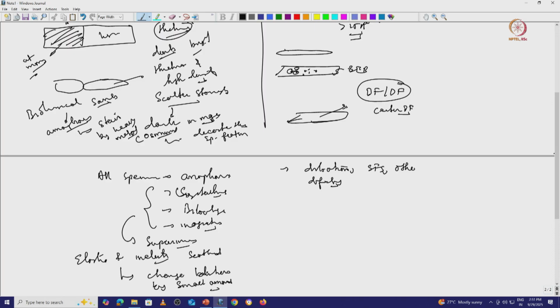Okay. So, here if any compounds are there which have a different composition, they can actually alter the structure factor f theta. So, it will directly affect the intensity, correct. So, this is a type of diffraction contrast.